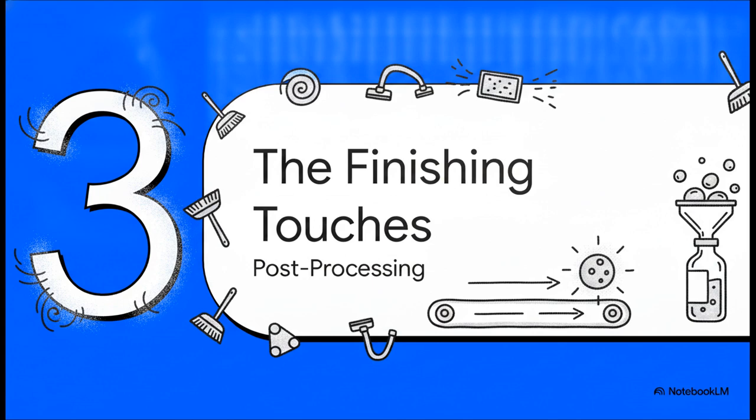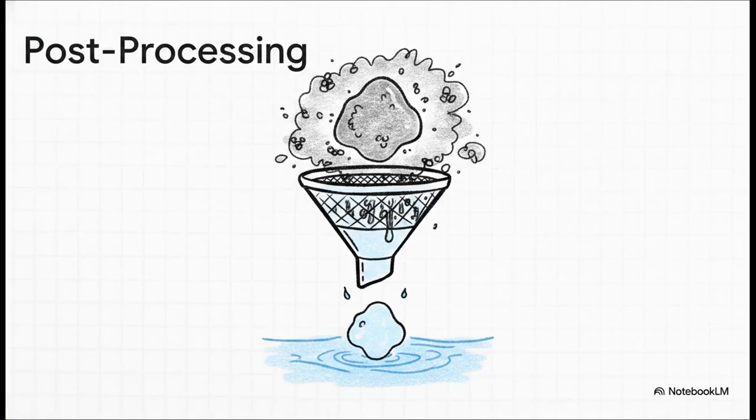Okay, on to Section 3, the finishing touches. So our newly formed LNPs are floating around, but they're in a mixture that includes residual organic solvents from that initial lipid stream.